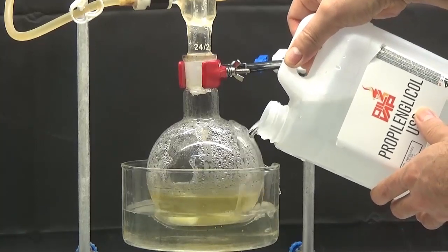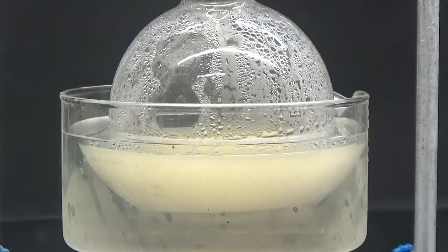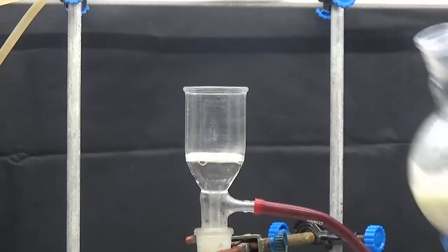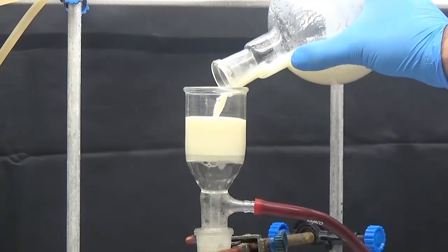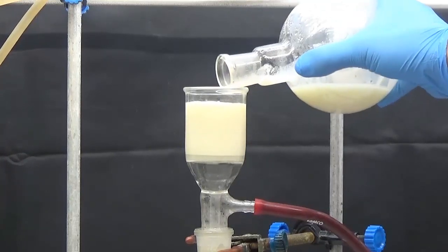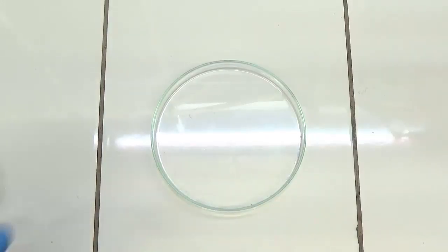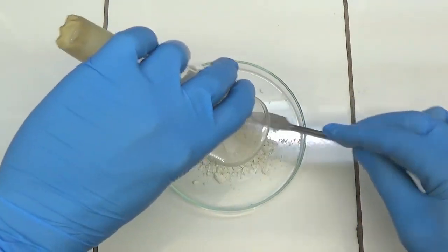I use a mixture of propylene glycol and water 70-30% that I keep in the freezer. Collect the solid by suction filtration and dry at 60 degrees Celsius. 2.8 g of isonitrosoacetanilide were obtained.